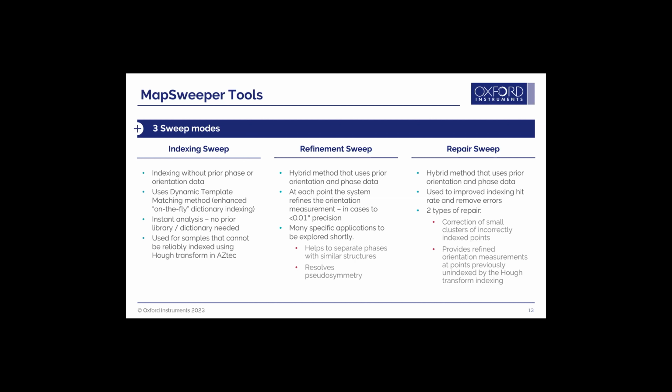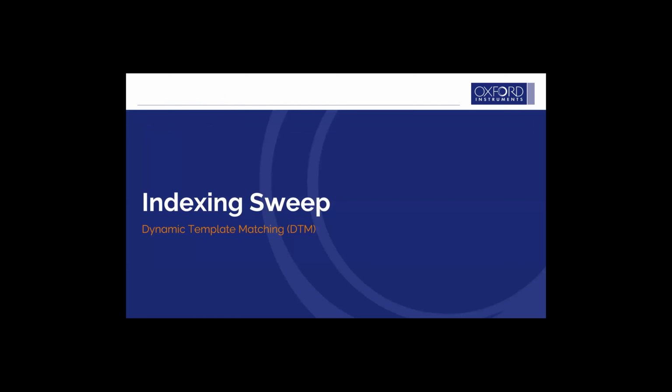And there are ways to take wild liberties and basically create false data. With the repair sweep, the whole thought here is there's something in the pattern that might be usable. Let's start there rather than just starting to look at nearest neighbors. With repair sweep, we often look at nearest neighbors just to get an idea of what the orientation might be and see if it can actually pattern match to a high degree what was collected.